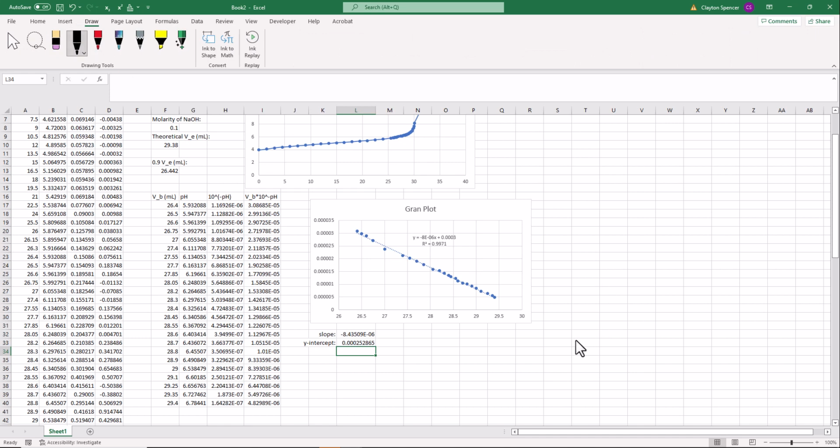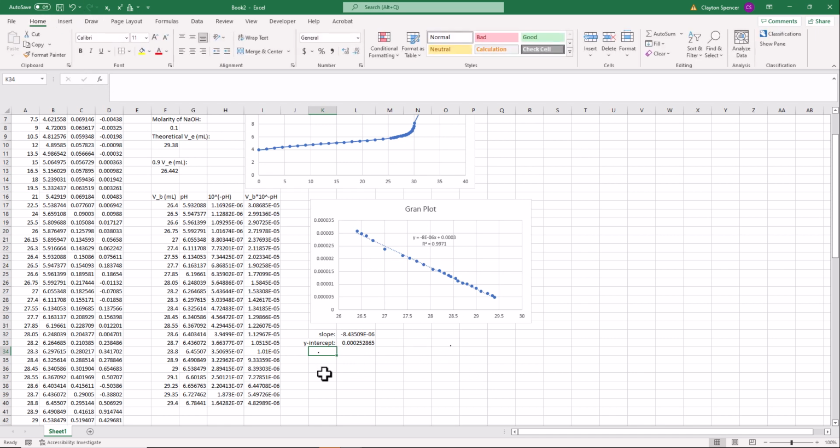So we need to now figure out what the x-intercept is. Go back home here. All right. So I have some weird dots here because I was entering draw mode to draw some stuff for you guys. Anyway, we're cool. We'll just go back here. Yeah, we want to figure out what our x-intercept is. Intercept, let's fix that. There we go. That looks good. Better. All right, line that up. Nice. All right, so how do we figure out what our x-intercept is?